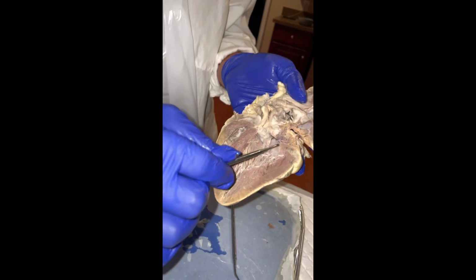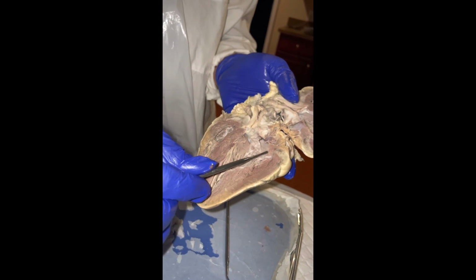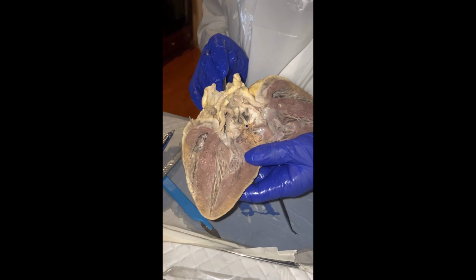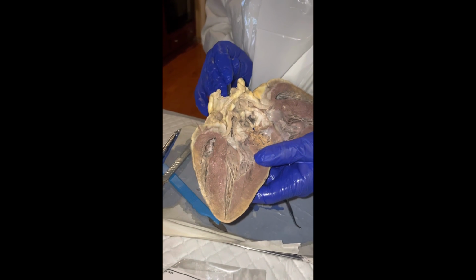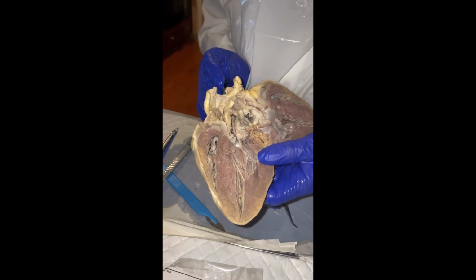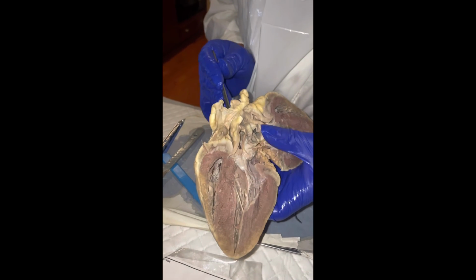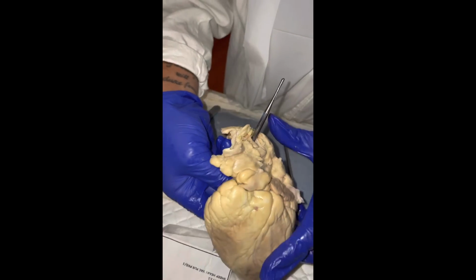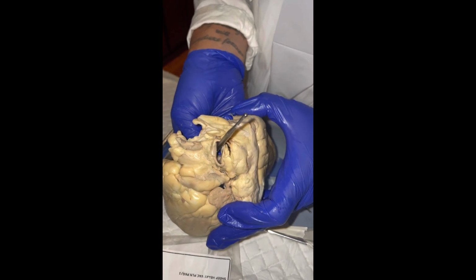Right in this general area is the aortic valve. We now find and locate the aortic semilunar valve. That's just right through here. If you go straight up, that will actually lead you to the aorta.